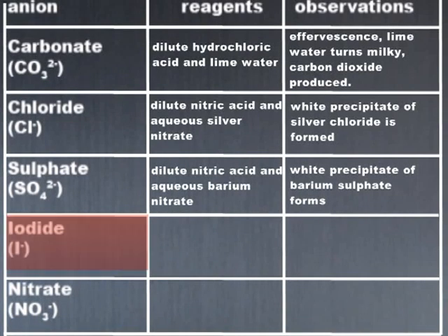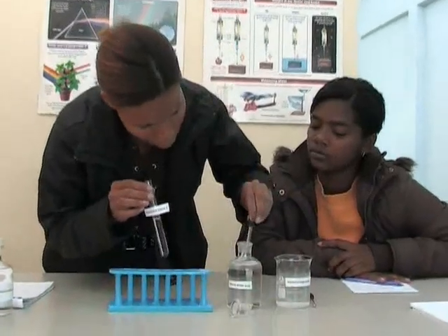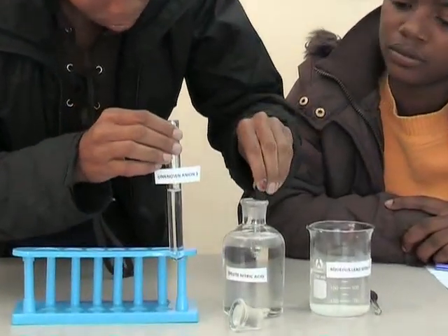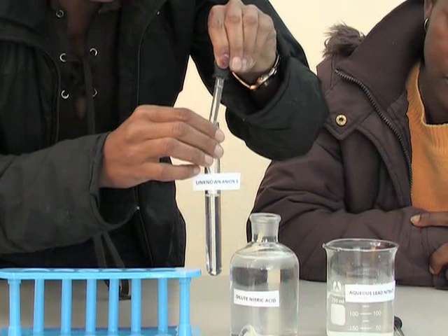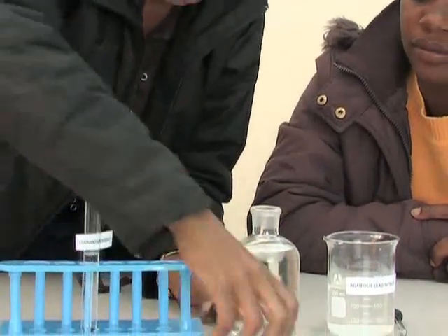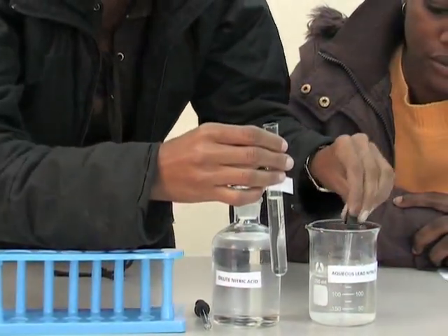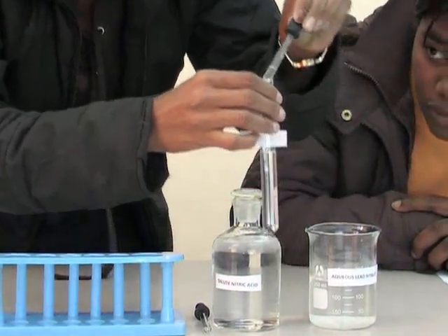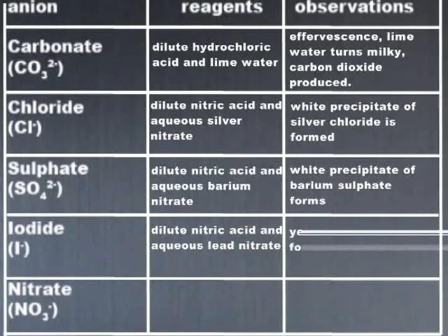Now we are going to test for iodide. We will again need to add dilute nitric acid and aqueous lead nitrate. To this unknown solution, I will add a few drops of dilute nitric acid, and then a few drops of aqueous lead nitrate. A yellow precipitate is formed. The yellow precipitate confirms the presence of iodide.